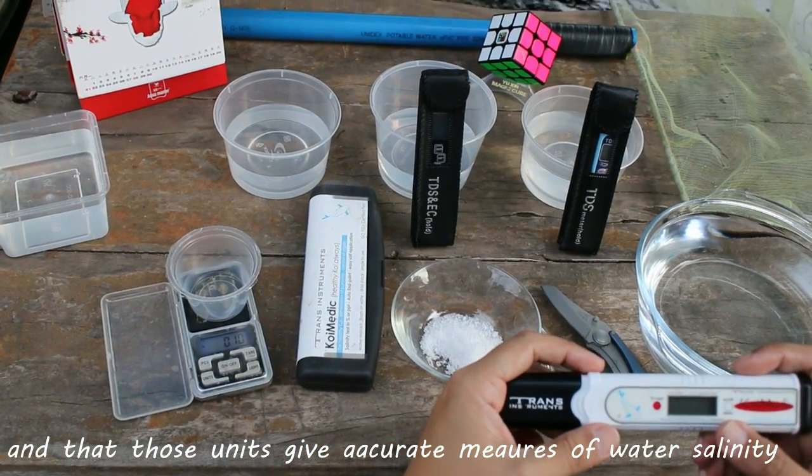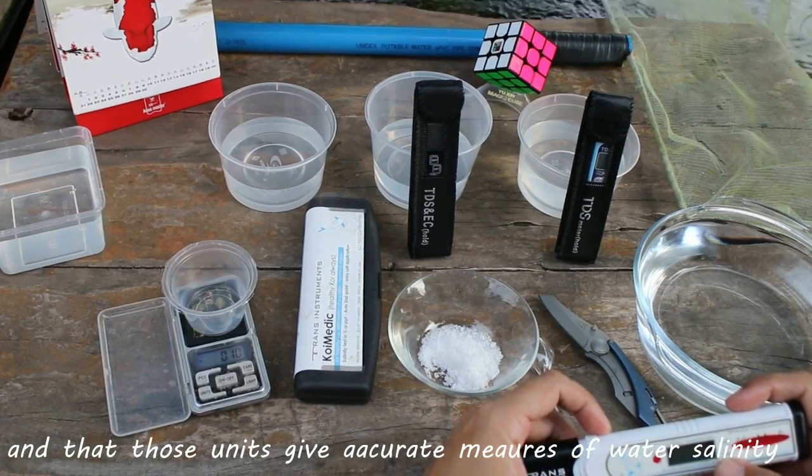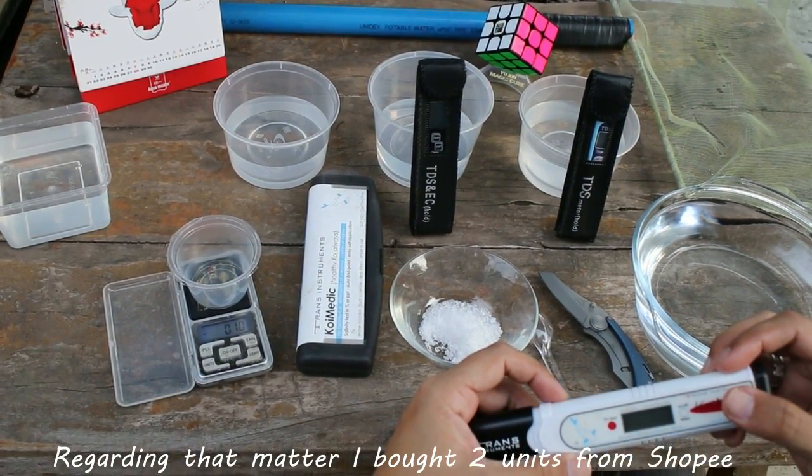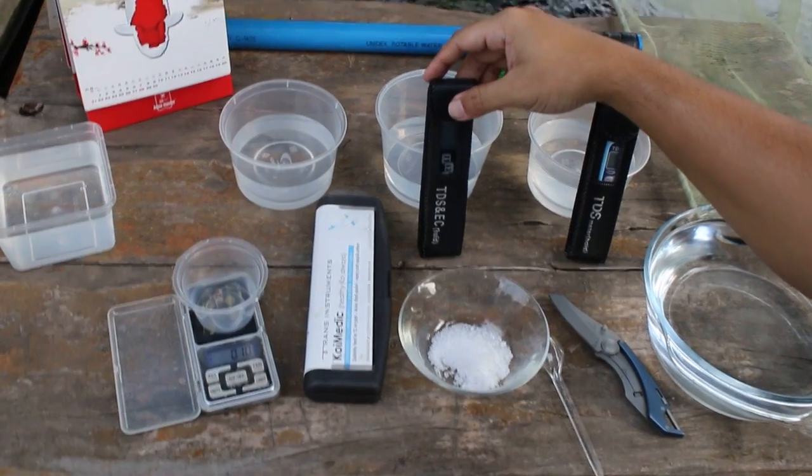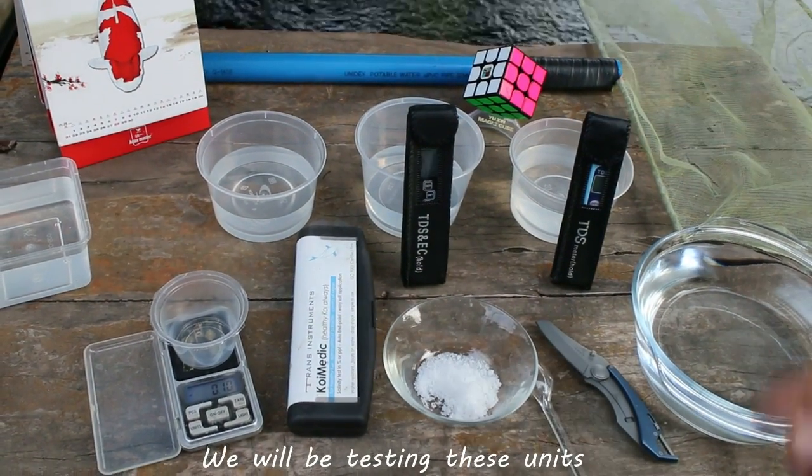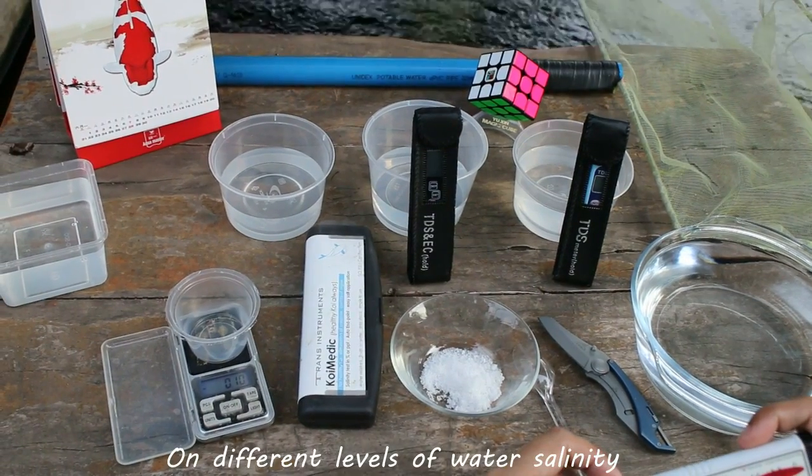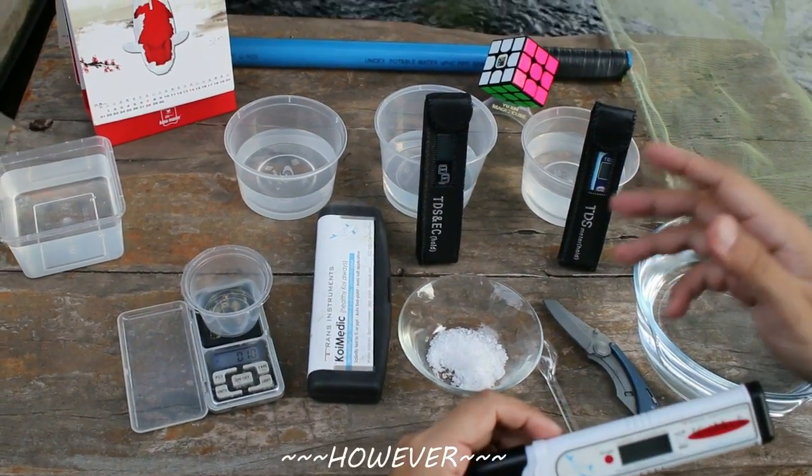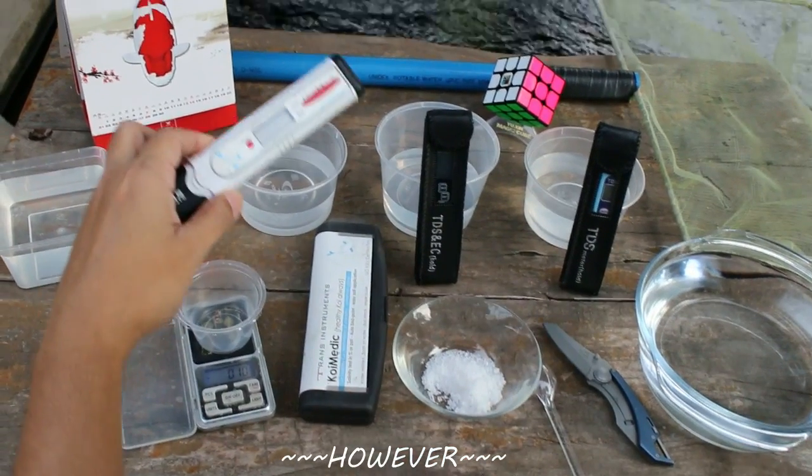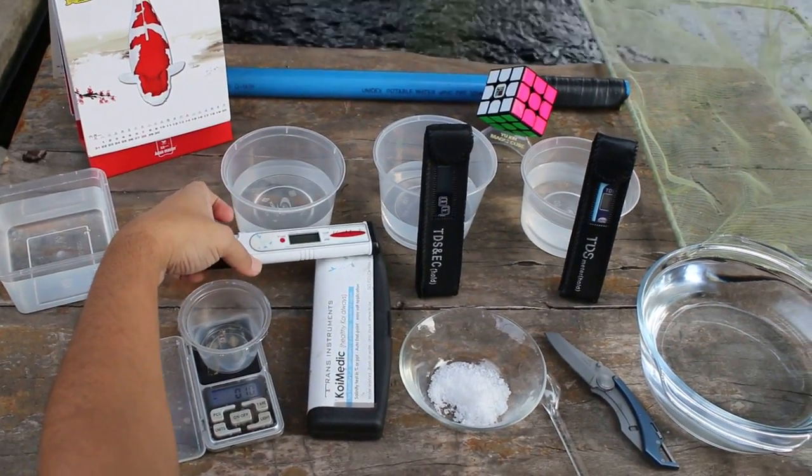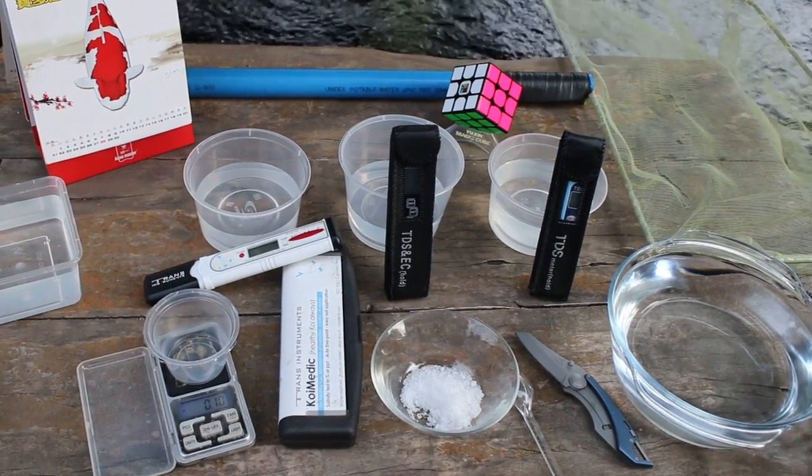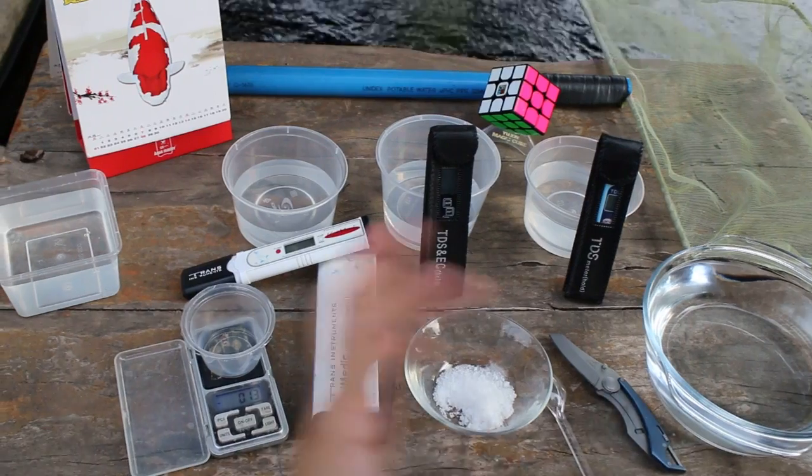Regarding that matter, I bought two units from Shopee, this one and this one. We will be testing these units on different levels of water salinity. However, before that, I'm going to show you some basics of salting of the water and how to compute for water salinity manually.